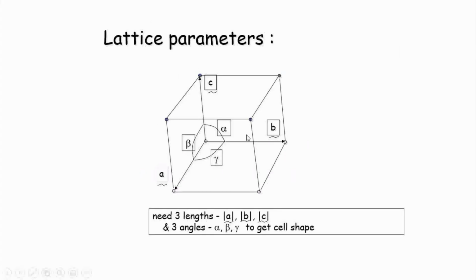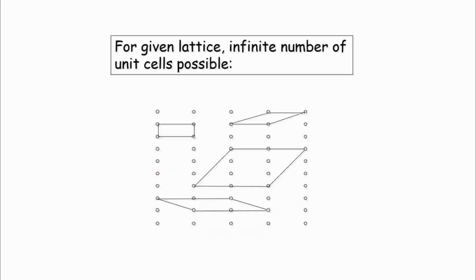Now, in this crystal lattice or small unit cell, apart from three vectors, you also have angles. These angles are not fixed. Basically you have three angles, alpha, beta and gamma, and they change with different samples. We have to understand these angles too, not only the vector direction, because it will not always be a fixed 90 degrees or a fixed cube. It may be hexagonal, with varying angles in different samples. So this angle identification is equally important.